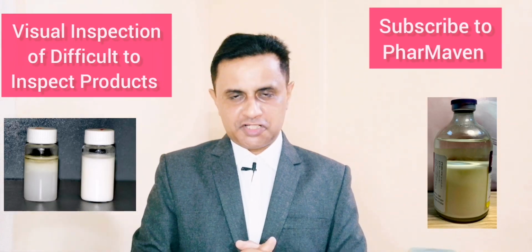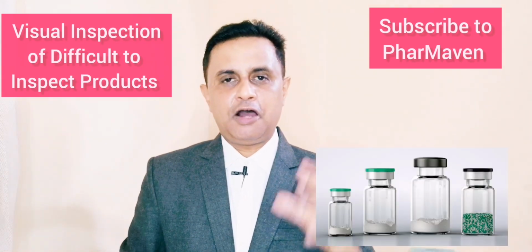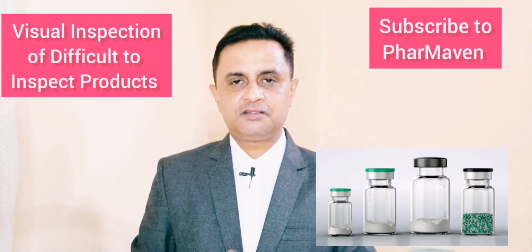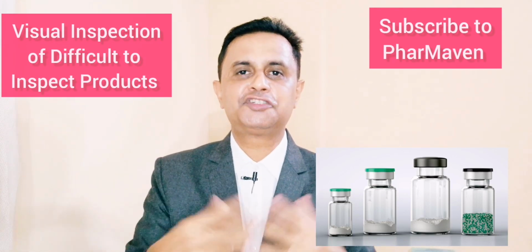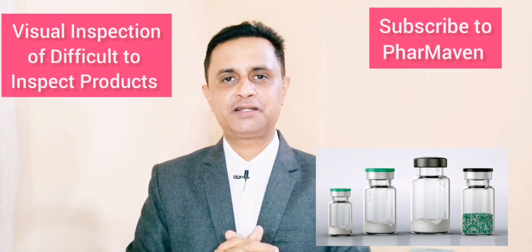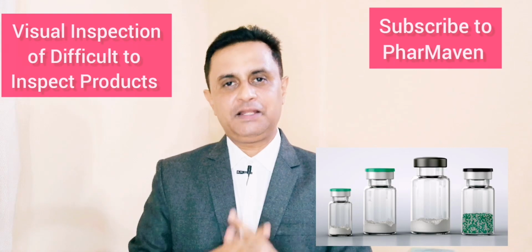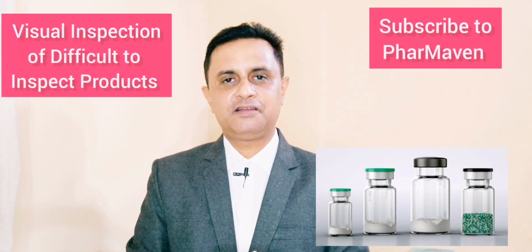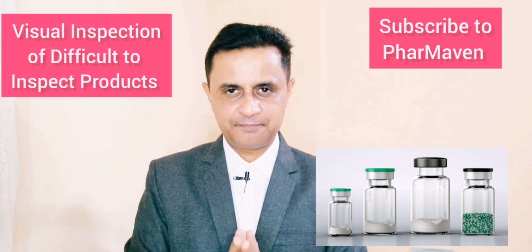For the powder dosage form, it is again difficult to inspect. Apart from the normal inspection, same as lyophilized products, certain vials have to be reconstituted in a controlled environment, and that clear solution has to be inspected as per the liquid injectable inspection process. On that basis we can decide whether it is a good product, a bad product, or we need additional sampling.